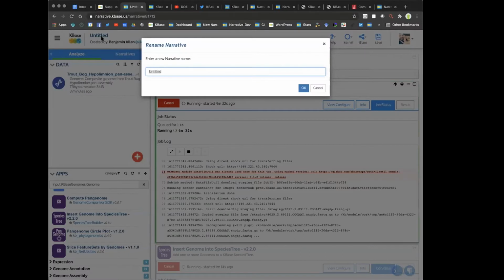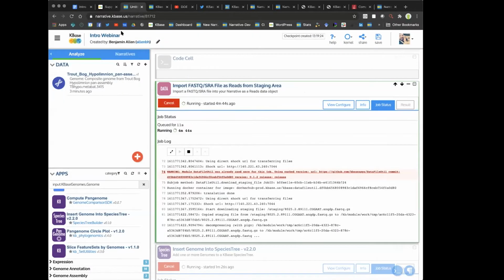I want to give my narrative a name here, and just call it intro webinar. And then I'll click OK. And it renames and then saves the narrative. It shows that little checkpoint dialog. I can see information about who created this narrative.